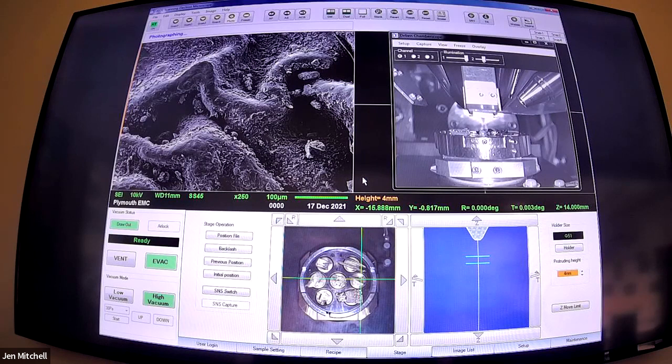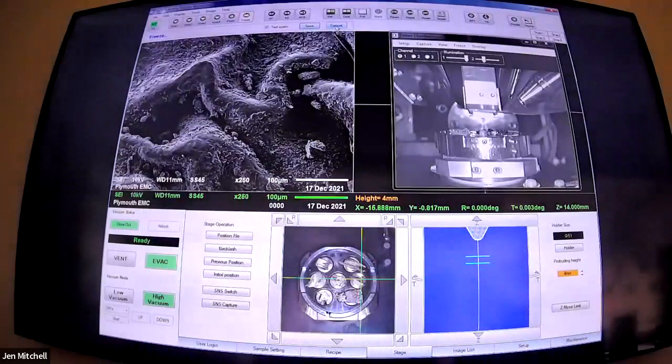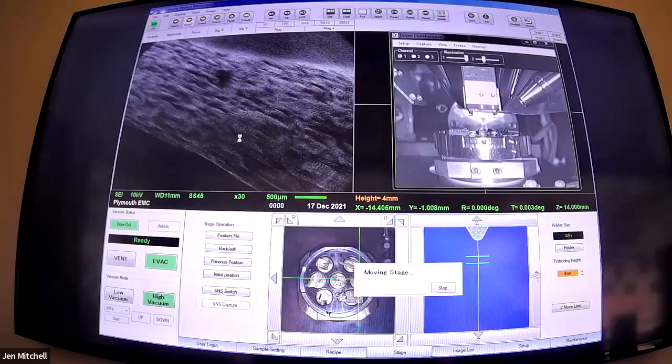The 6610 is actually a very forgiving instrument - we use this one for teaching, it behaves itself when we teach. It's not quite so fussy as some of our other microscopes and it's a lot easier to focus. Ours is quite old, which does mean when we are driving around it makes the loudest sounds possible - it sounds really unhealthy, but it does work very well. So yeah, that's a clove - not sure I like it.